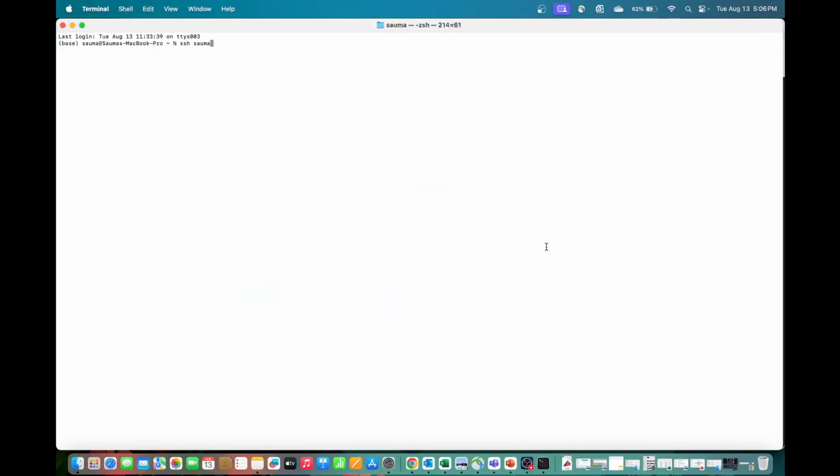Your username will depend on the account name of your profile in the system that you're trying to connect to. In my system, my username is this, and then you give an at the rate, and then you have to type the IP address. Let me check my IP. Yeah, so this is my IP address.